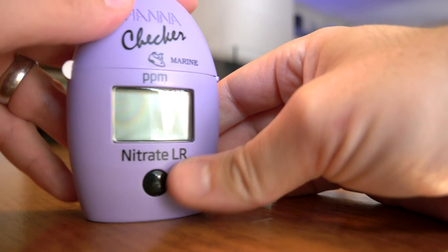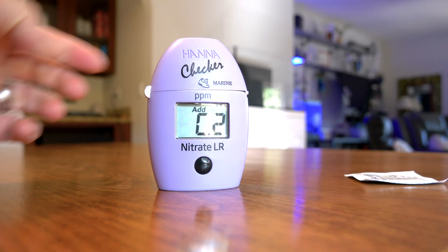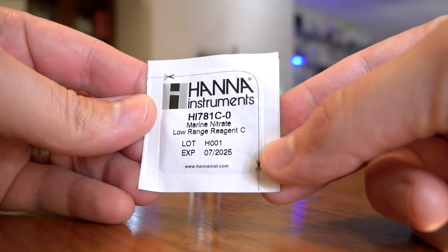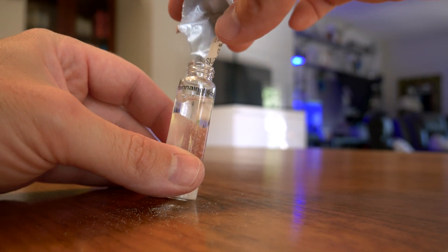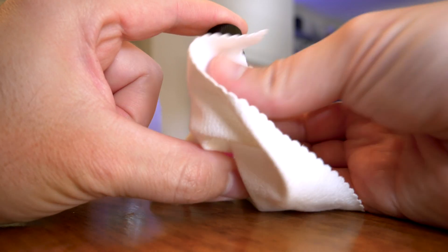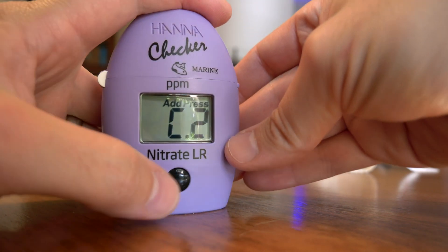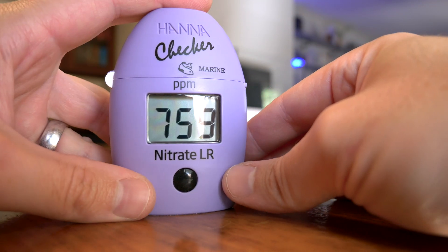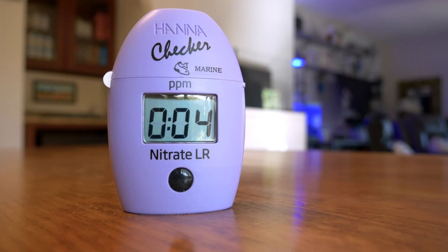Wipe off the outside of the cuvette, place it back into the checker, and press the button. Remove the cuvette, unscrew the cap, and add the contents of one packet of the C reagent. Replace the cap and shake vigorously for two minutes. Insert the cuvette into the checker, close the cap, and press and hold the on/off button until the display shows a countdown of eight minutes. When the timer ends, the checker will perform the reading and display the concentration of nitrate in parts per million. If you diluted your sample, multiply the result by 10.